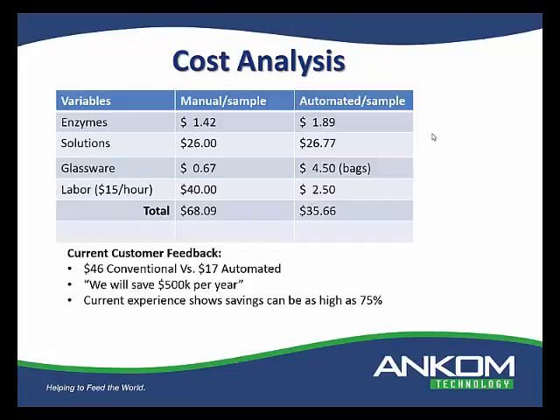As long as the instrument is not turned off and there's not a 12-hour waiting period between runs, then it will not continue to do a line charge. So most labs, I'm sure, are running at best 2 shifts. So each morning you're going to get a line charge. And so we factored that in. We're assuming that there's going to be a line charge every day. So that line charge is really just your first run of the day.